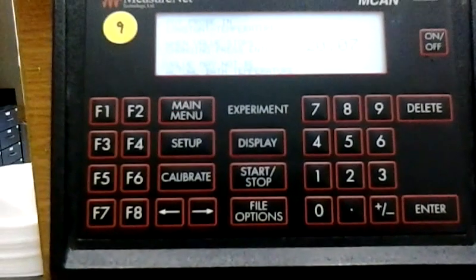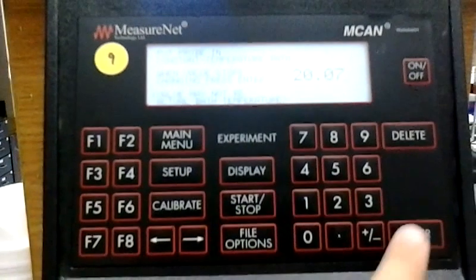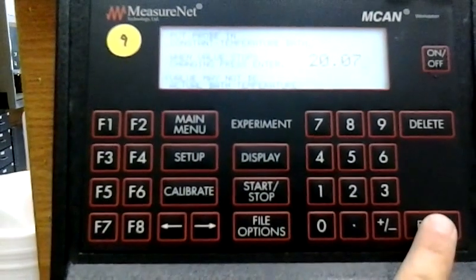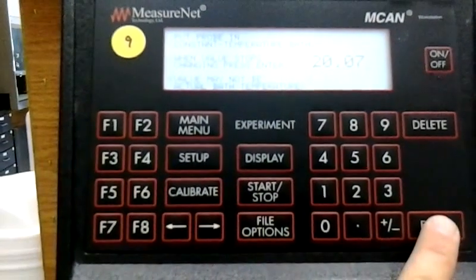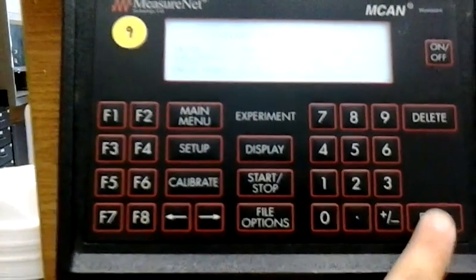Meaning it's not moving, and hit enter. So now that I've seen the temperature stabilize at 20.07, I hit enter.